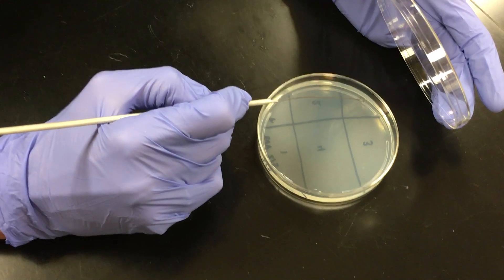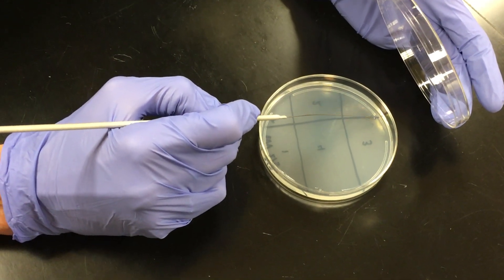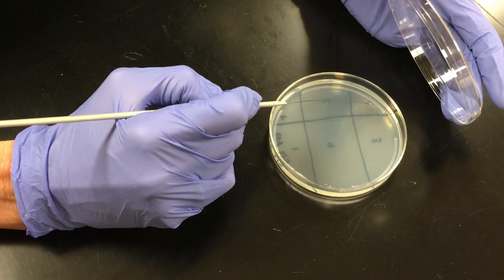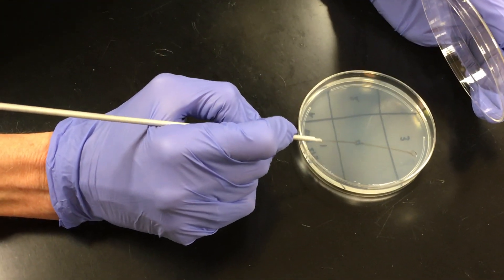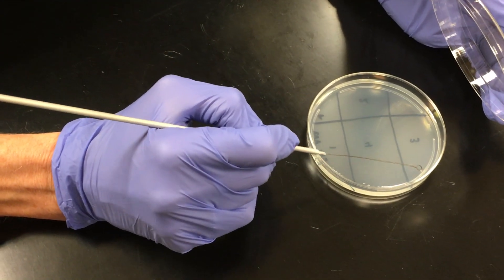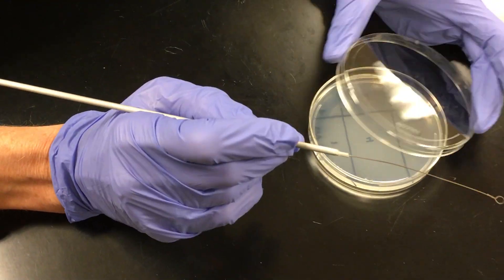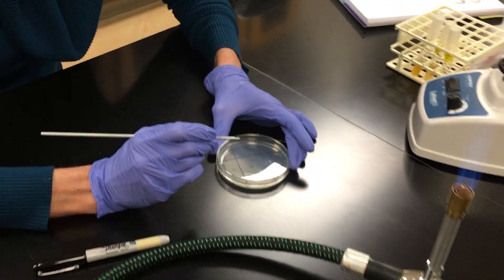And so I'm going to do that again, five times. So I'm starting, I'm taking some bacteria from this quadrant two, I'm streaking them into three, one, two, three, four, five times. And then I'm going to stop and I'm going to close my lid.